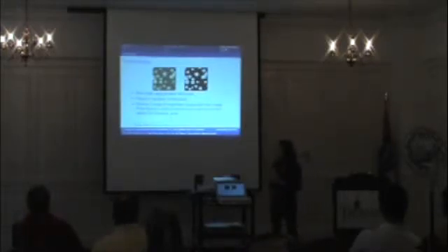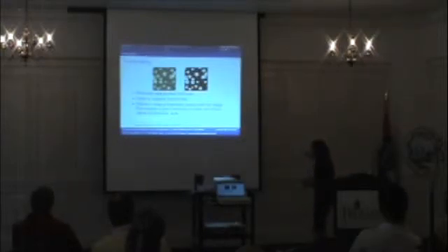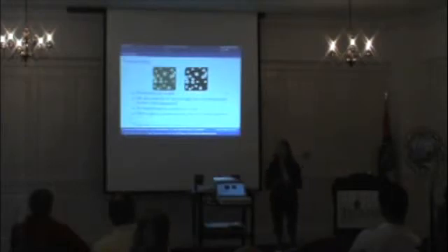Adaptive thresholding looks at little bits of the image at a time, so maybe it'll split it up into a grid and focus on just a certain neighborhood of pixels, and we'll have different threshold values for that. So that's really useful and important. Using methods like that, we can use this as a pre-processing step pretty easily. It's computationally simple, so we don't have to worry about it.